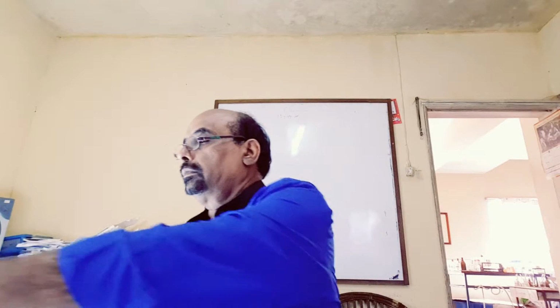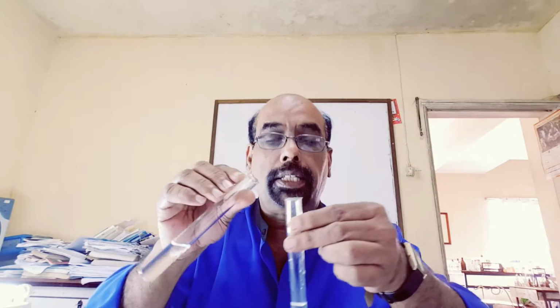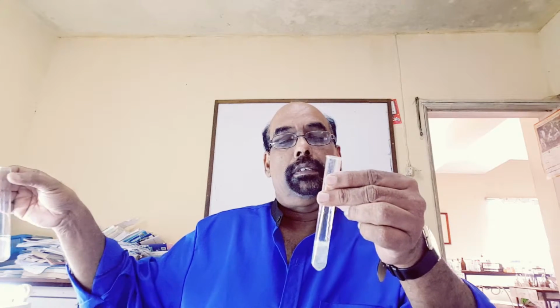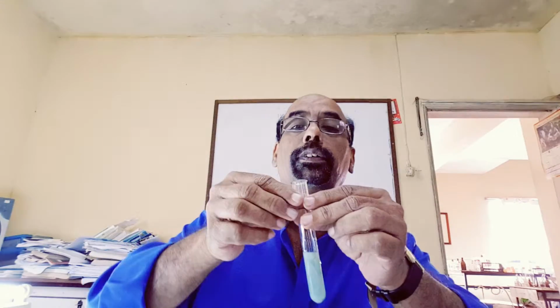So I am going to take a small amount of iron 2, not so much, a small amount, 1 centimeter cube. And to this, I am now adding aqueous sodium hydroxide. Slowly I add, I observe, a green precipitate is obtained.